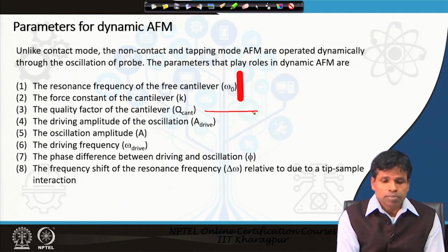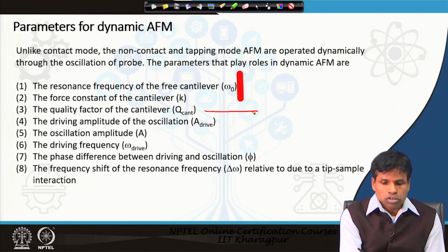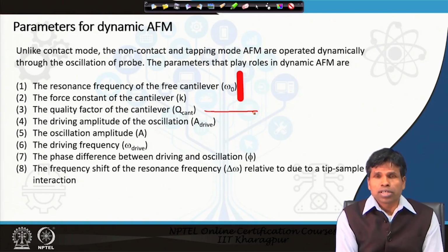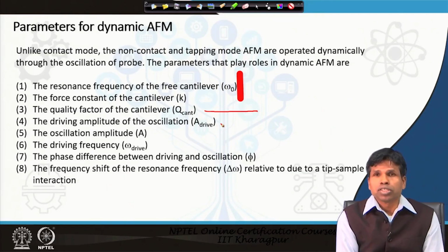The quality factor is very high, above thousands. So, the non-contact mode is preferred in the vacuum environment.